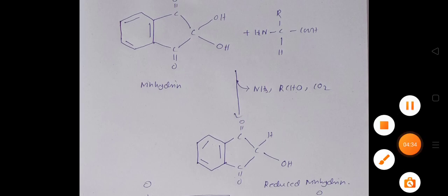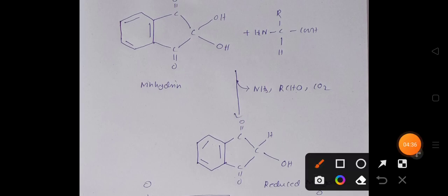Okay, so that is the idea of our Ninhydrin test. The concept is the same. You will add the Ninhydrin reagent, then you will perform colorimetric analysis, right?